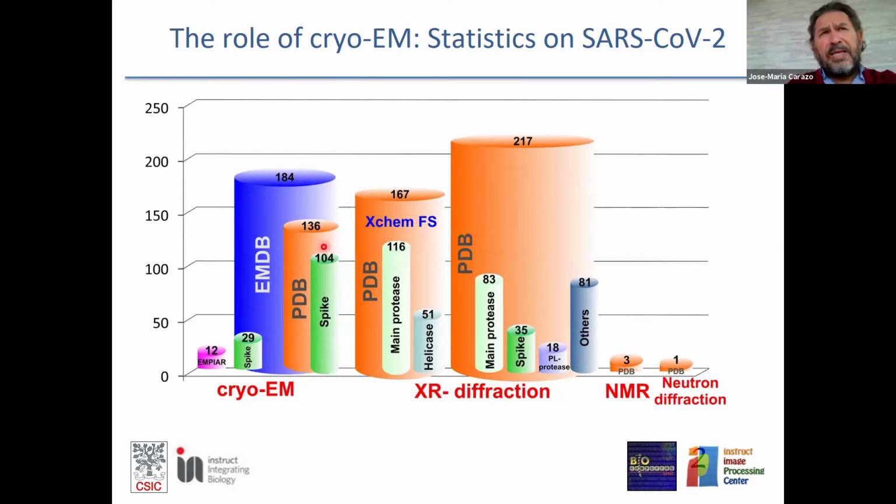One is that, as I was telling you, it is key for many of the therapeutic treatments we have for the virus. And the other is that although in cryo-EM we can work with a wide range of specimen sizes, there are especially sweet spots, and a specimen of about 500,000 Dalton with all the glycans is in one of these sweet spots. So the importance of the specimen to start with, and the fact that it was good for this technique, explains a good part of this result.